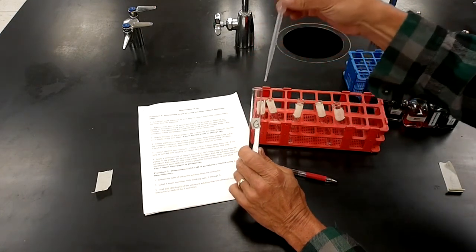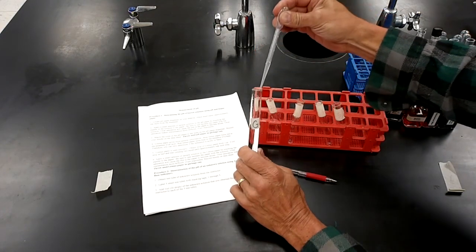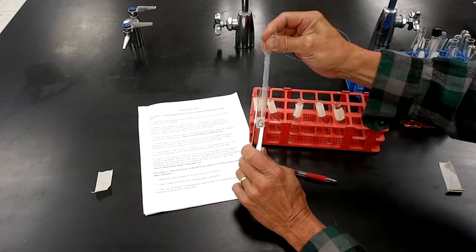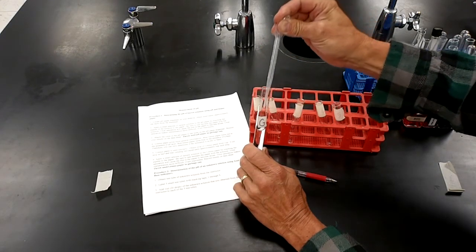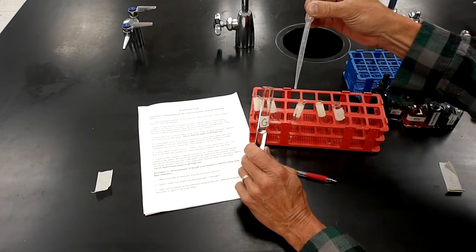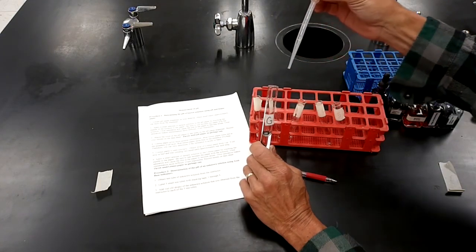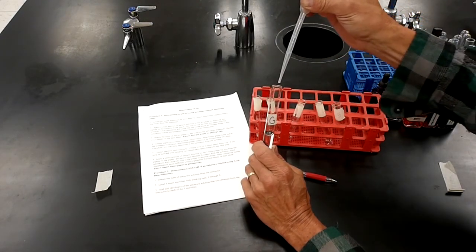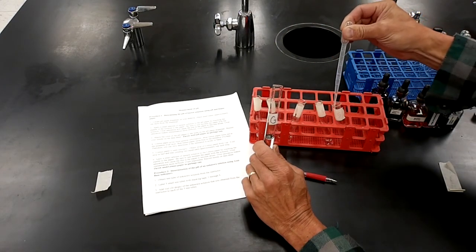I will use this pipette to add 1 milliliter into tube 1, 1 milliliter, tube 2, 1 milliliter, tube 3. See, there are graduations on my pipette. 1 milliliter, tube 4, 1 milliliter, tube 5.